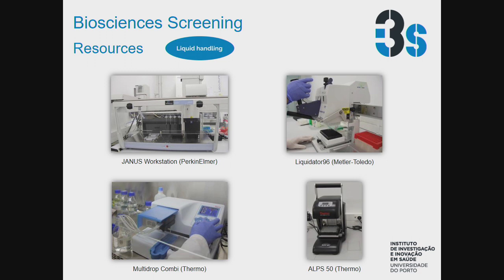We also have a thermo heat sealer, so whenever you need to seal your plates, if you require that in your protocol, or if you need to seal the plates before you freeze them, you can use our semi-automated heat sealer.